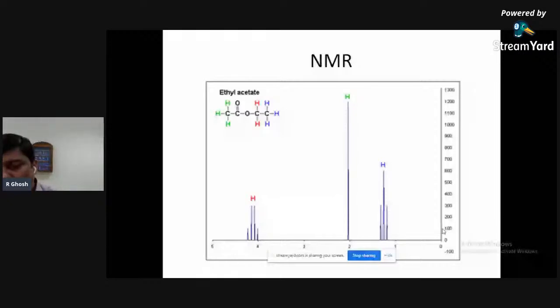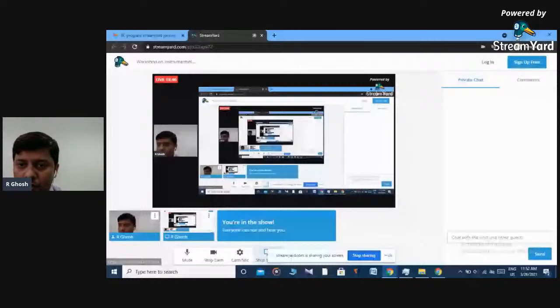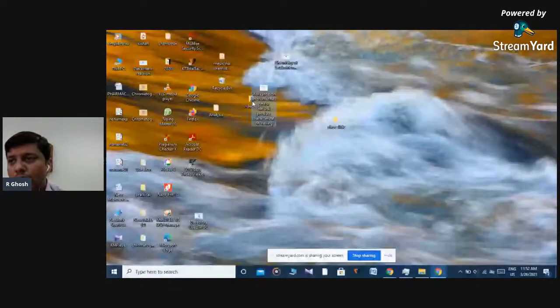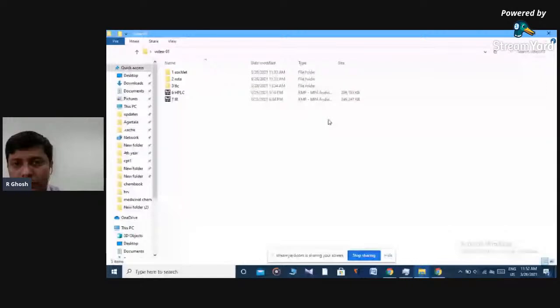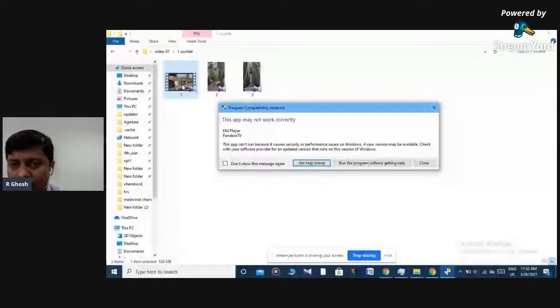Now I would like to show you people a few videos. This is the first video, where the extraction has been done with the help of Soxhlet.